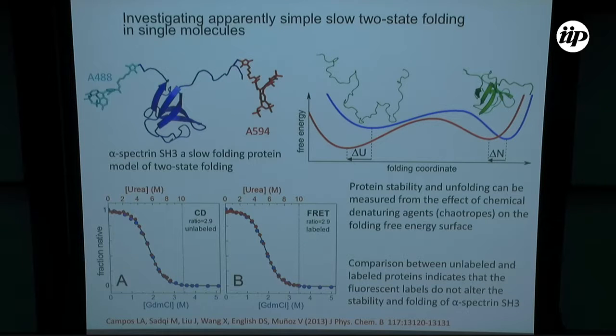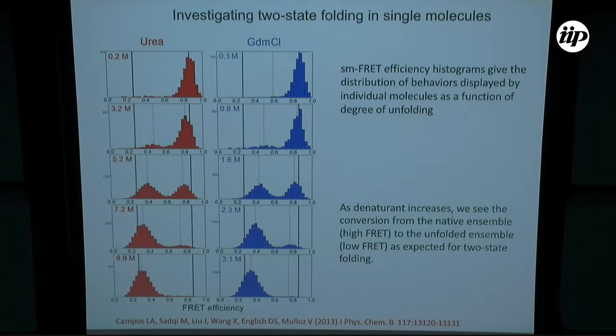And here what we are doing is trying to look at both denaturants to see that the effects that we have are not denaturant dependent, so that you see them in both. And what you can see, obviously the strength is different. This value is still a little bit less than this, but it's close. This is equivalent to something like 9.2 molar urea. Okay, but the important thing here is this is the native state, and you have it in both.